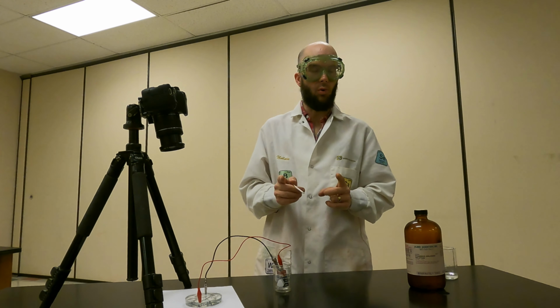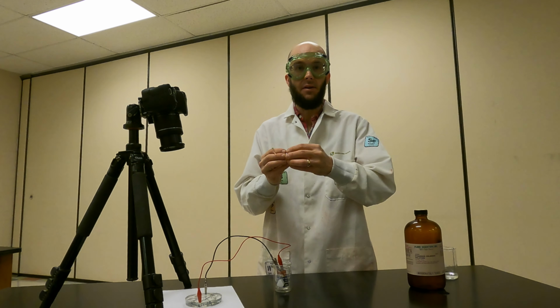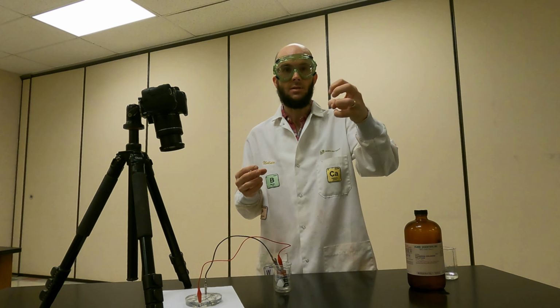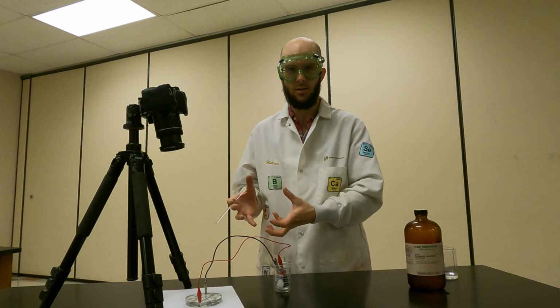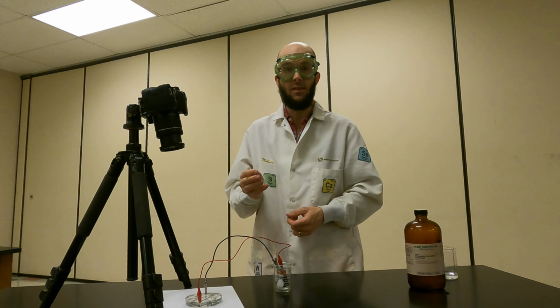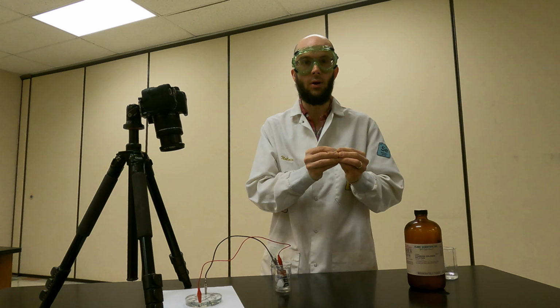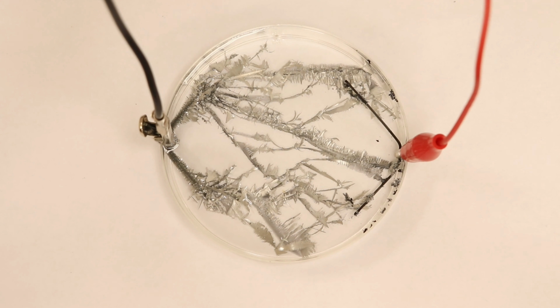Now remember, we started with tin chloride. And when I applied energy to that aqueous solution, the tin separated out from the chloride. So the tin atoms went and found other tin atoms to form this beautiful silver branching sort of snowflake-like structure inside the petri dish. And then the chlorides went and found other chlorides bonded together and made chlorine gas. So the chlorine gas escaped into the atmosphere, but the tin metal was left behind in the petri dish.